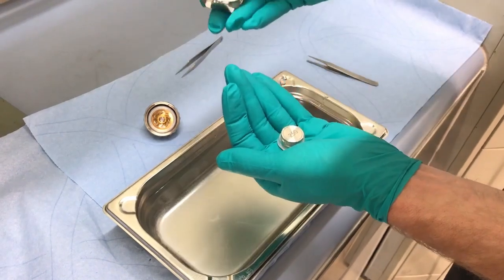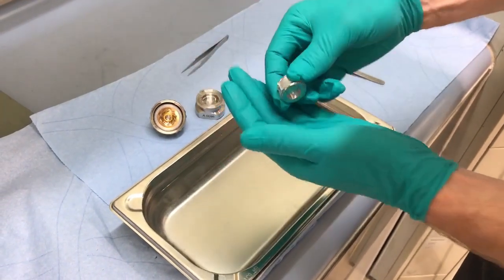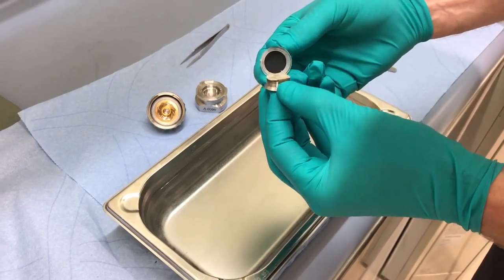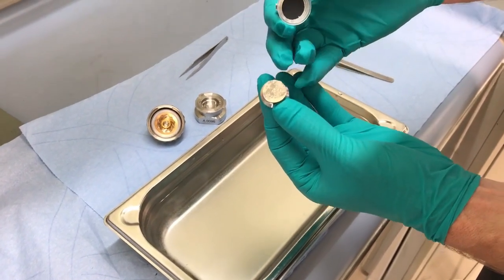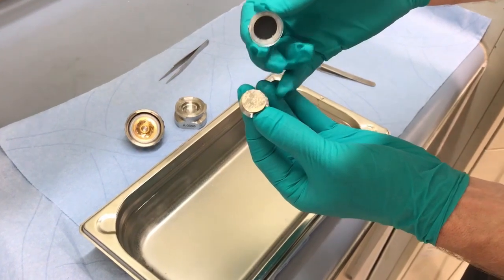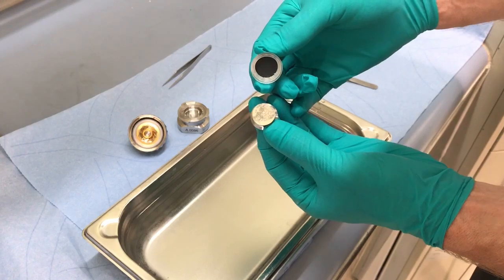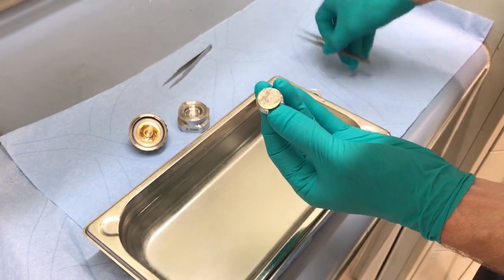We remove the pad core as a whole. The upper plunger shows the lithium metal and also part of the separator sticking to the plunger. The black color in the sleeve is the graphite electrode.